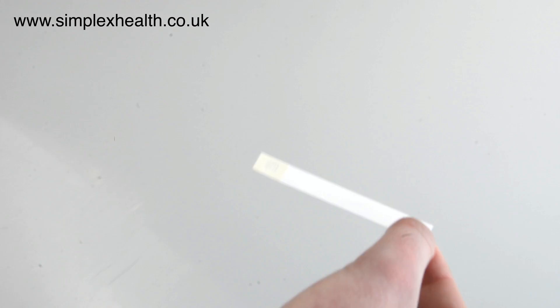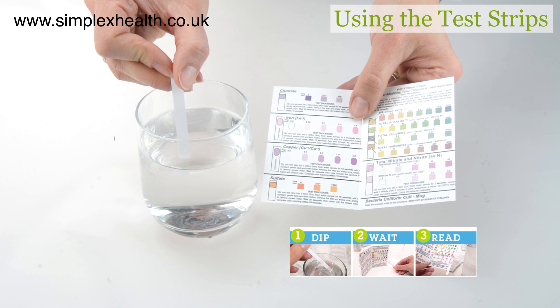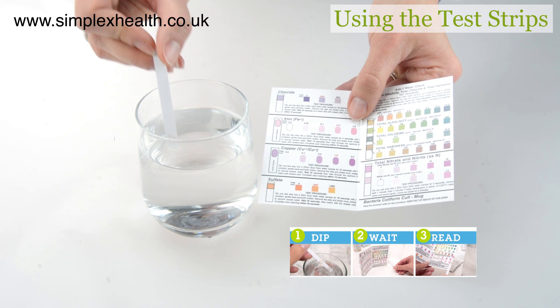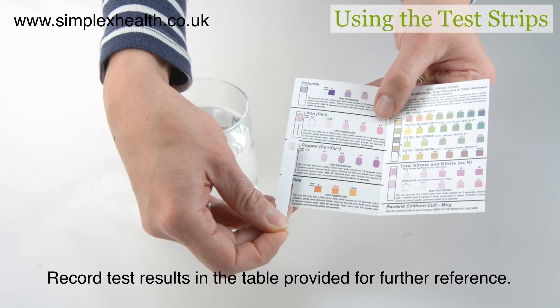To test water with the test strips, simply put the test strip into your water sample for the required amount of time, wait according to the instructions, and then compare the color change to the appropriate color chart.